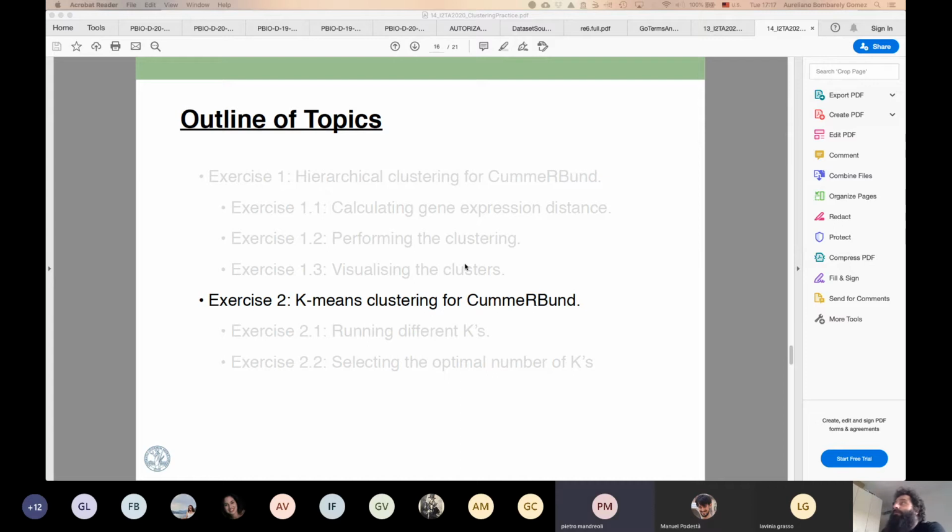Okay. Yes, go ahead. Another result on a cluster plot, and I don't know why. Then I repasted the command for ggplot, and now I have the correct plot. Yeah, I don't know. As I said, it's difficult for me to see, but you have the correct plot at this point. Yeah, it's good. Okay, so let's go to the kmeans fast.